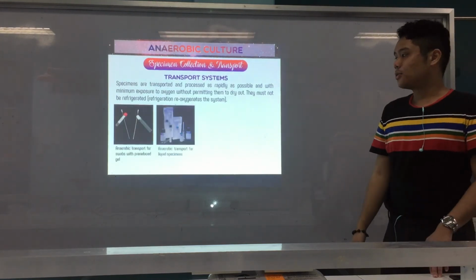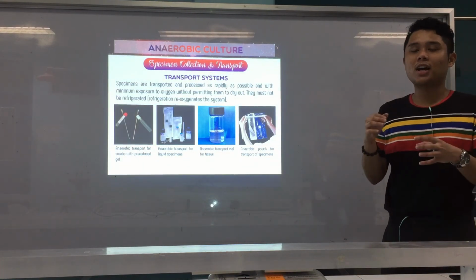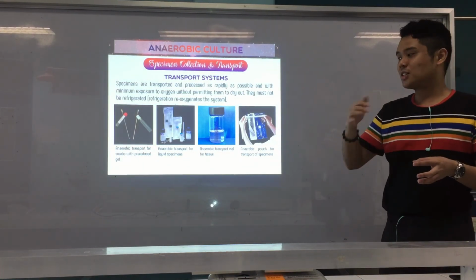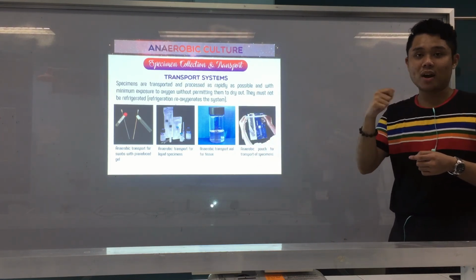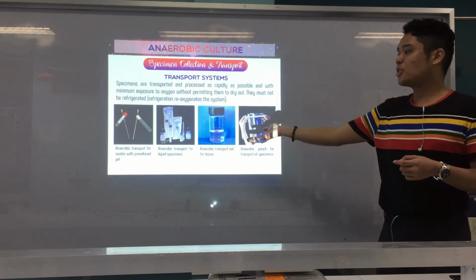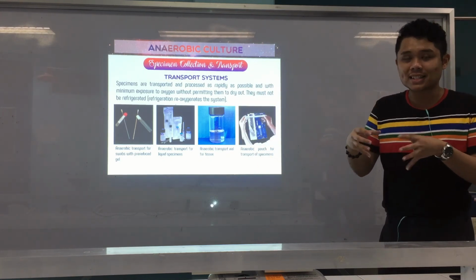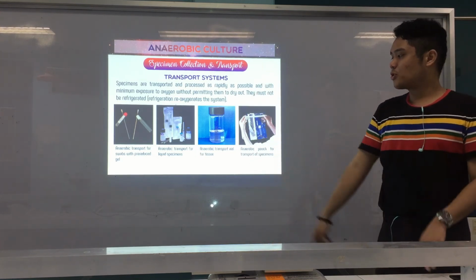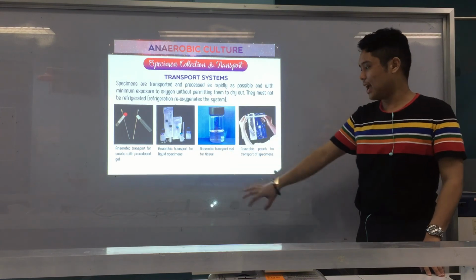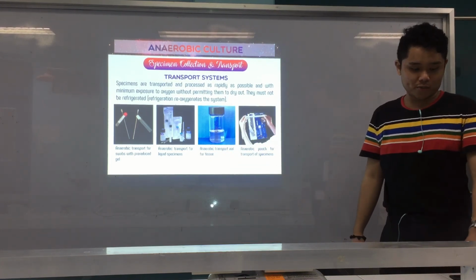Okay. So these are the different methods of anaerobiosis or anaerobic environment, no? Pag-transport. So pwedeng anaerobic transport for swabs, di ba? Kung kailangan dyan mag-swabs with pre-reduced gel. Anaerobic transport for liquid specimens, imo sa siyang ibutang og murag package or packet na murag plastic para dili siya ma-expose again to oxygen. Anaerobic transport vial if tissue, okay? And for pouch, pwede pong pouch for transport of specimens.